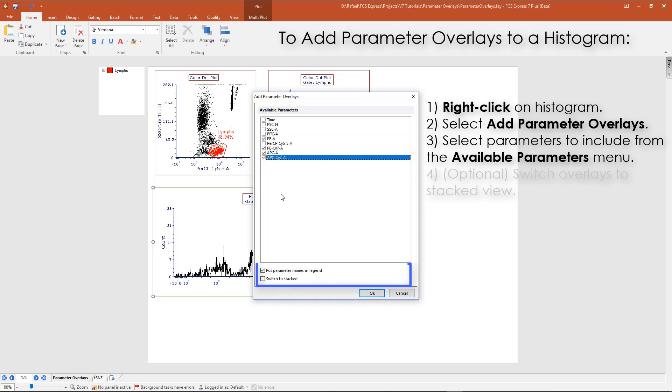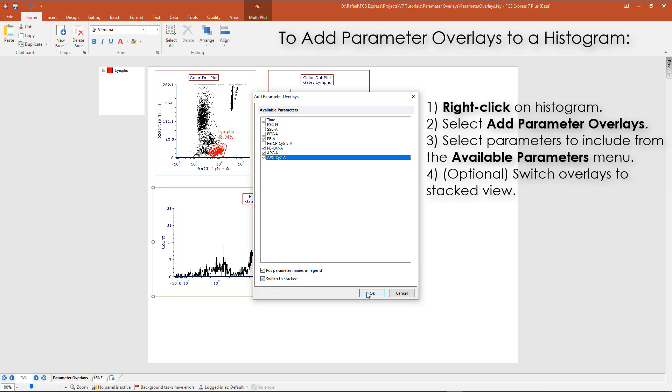By default, the selected parameter names will be added to the plot legend. You may also switch the default setting for histogram overlays from Overlayed to Stacked by checking the appropriate box at the bottom of the Add Parameter Overlays window. Click OK to close the window.